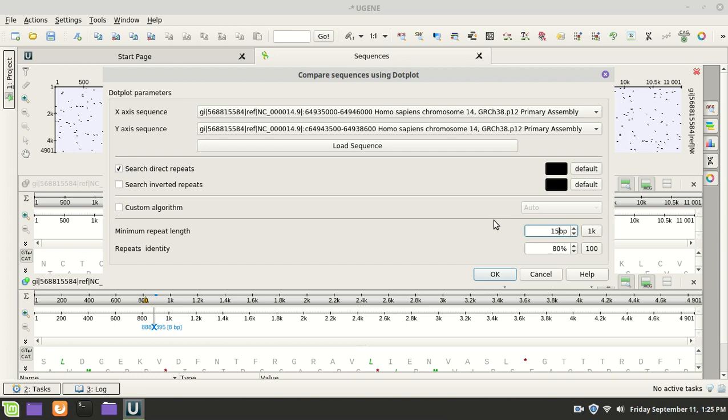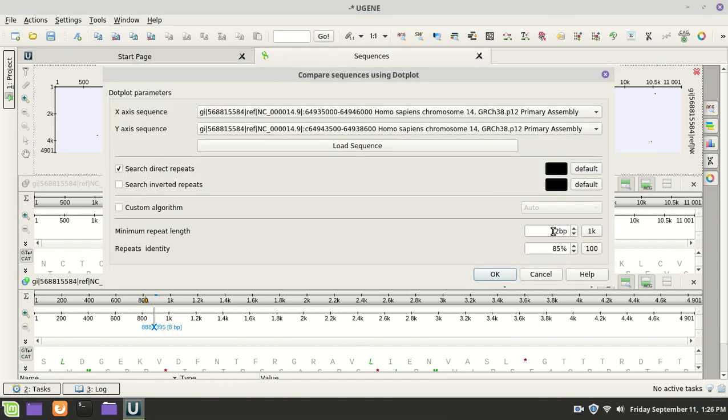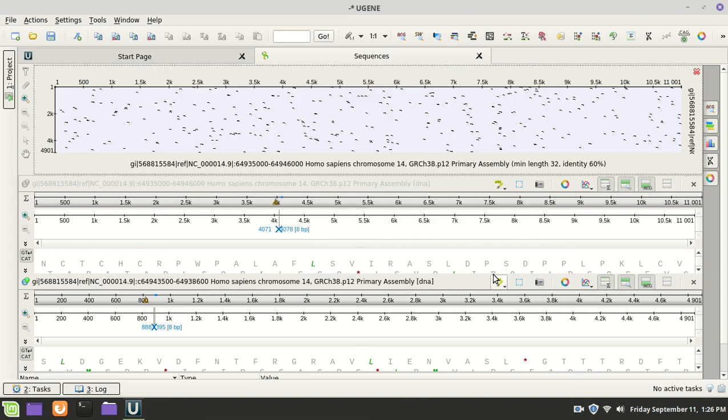I'm going to go down here, and I'm going to go up here and see what we get. And so we've reduced it back down to very little again. Let's try a couple more. A lot of times you can do something. Let's go way up. Let's go 32 again, and go way down here. Okay. Still just nothing huge here. I get something that looks kind of interesting going this direction, but nothing there.